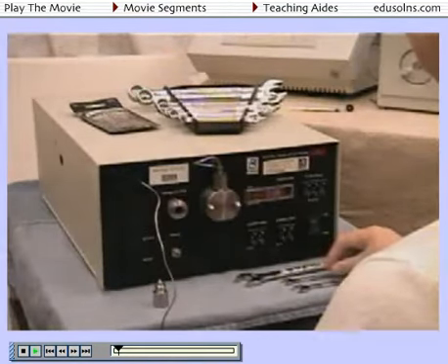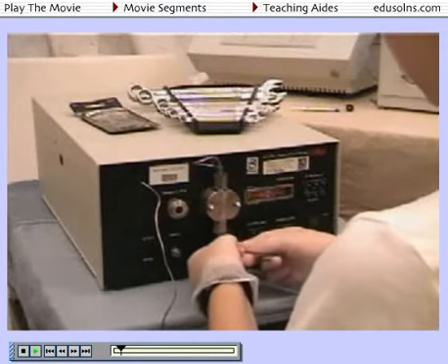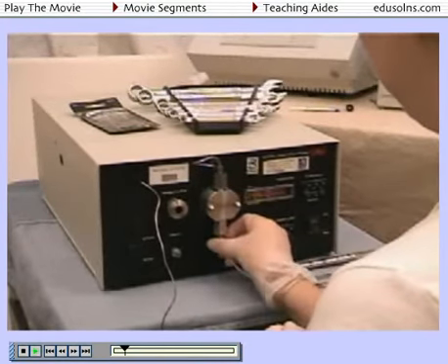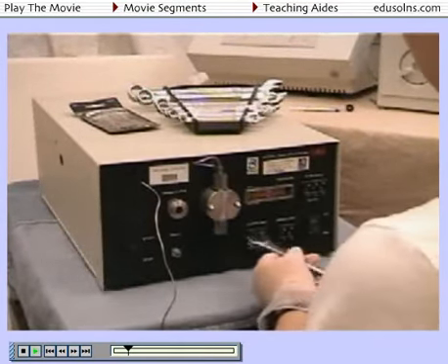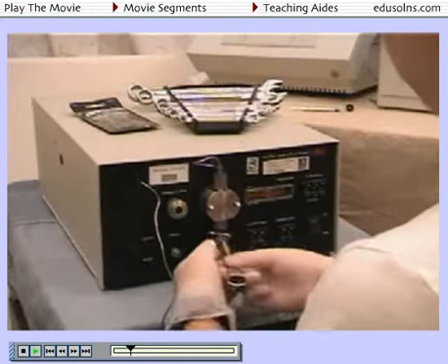The pumps require maintenance from time to time. The most common maintenance operation is to clean the piston and replace the pump seals. It's time to do this when there are leaks around the pump, unstable back pressures, or no flow exiting the pump. We will illustrate how to clean and replace the pump seals with an older stainless steel single pump head system. First, the inlet Teflon tube from the solvent reservoir is removed.